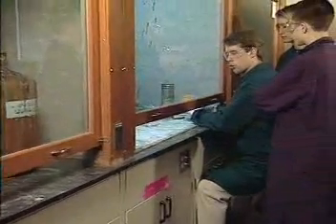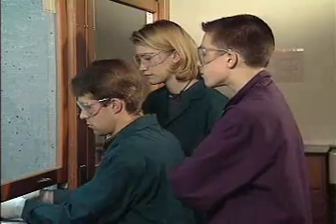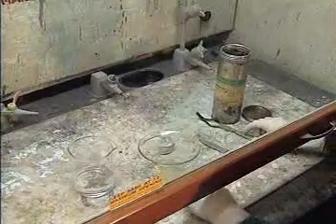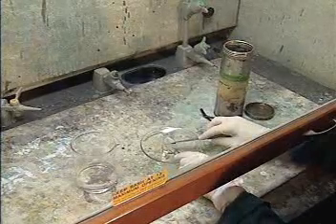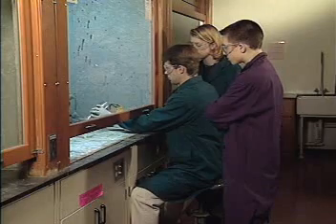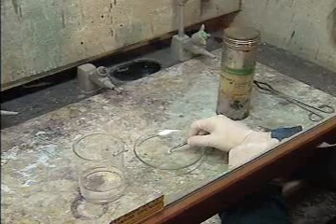For this reaction, we cut off a small piece of sodium metal. See the shiny surface? Yeah. We'll put the rest back in safe storage. And put our slice into the water.